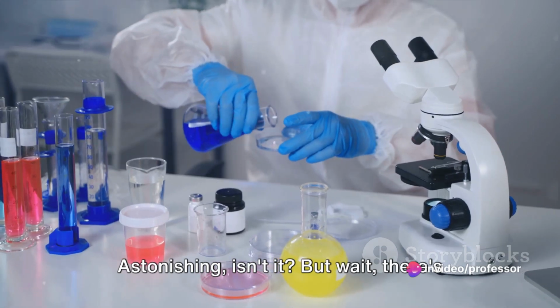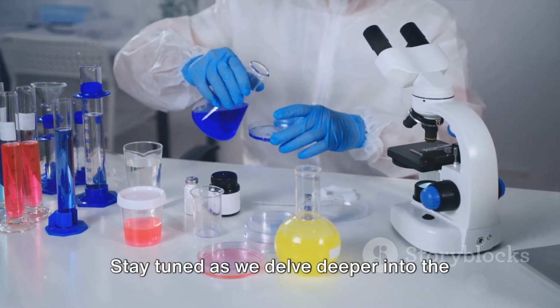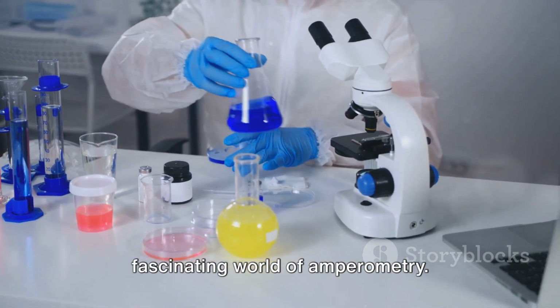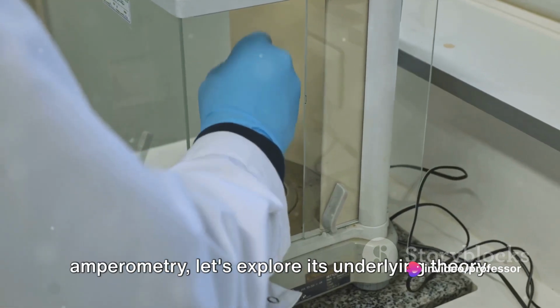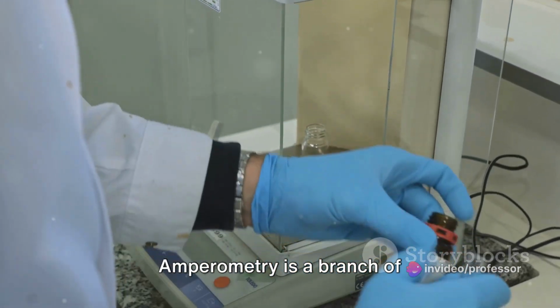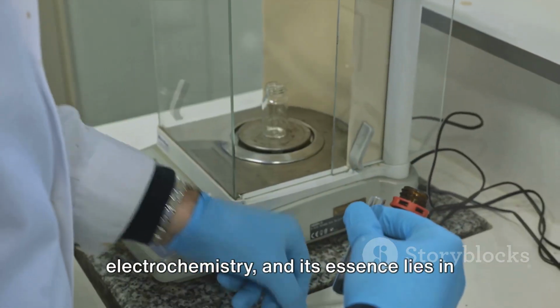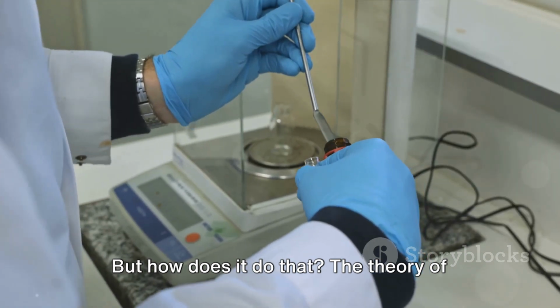Astonishing, isn't it? But wait, there's more to amperometry than meets the eye. Stay tuned as we delve deeper into the fascinating world of amperometry. Now that we've briefly introduced amperometry, let's explore its underlying theory. Amperometry is a branch of electrochemistry, and its essence lies in the measurement of electric current. But how does it do that?